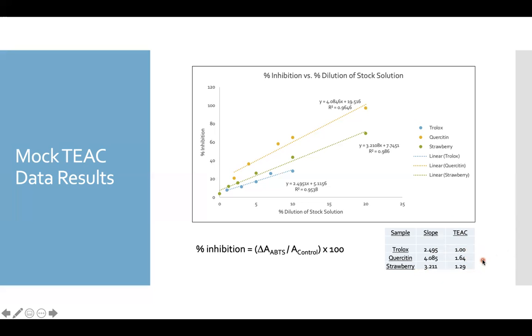One downside to this assay is that it doesn't reveal which compounds within each supplement exhibit the antioxidant activity. It's solely a comparison of the whole supplement. One upside to this assay is that it is fairly quick and easy to perform.